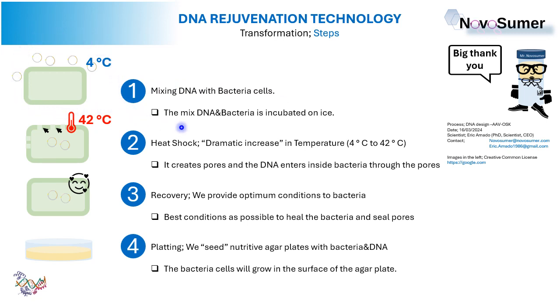We mix the DNA and the bacteria, and we incubate the mix on ice. The temperature will be close to 4 Celsius degrees. Okay, this is the first step, just simply mixing the DNA and the bacteria. And what is the second step? Look here. Do you see here?